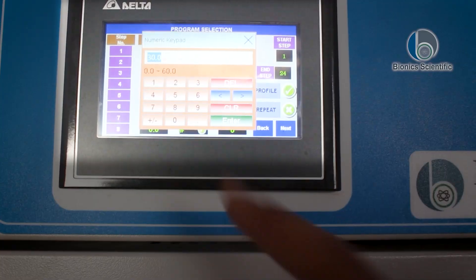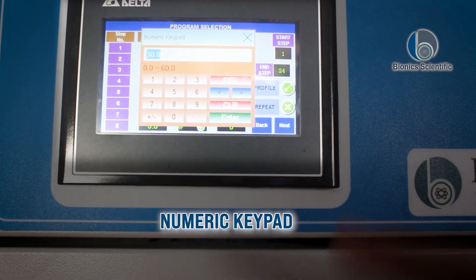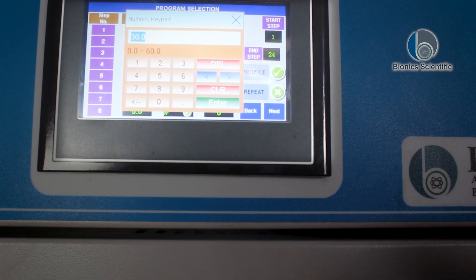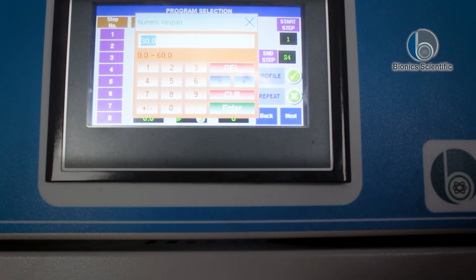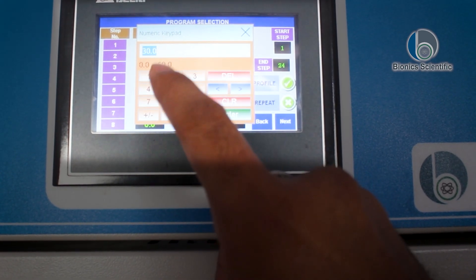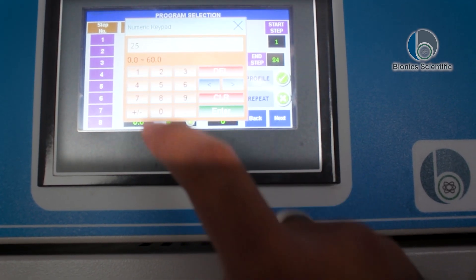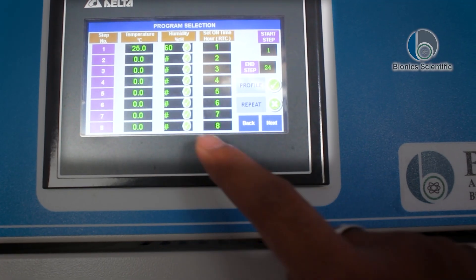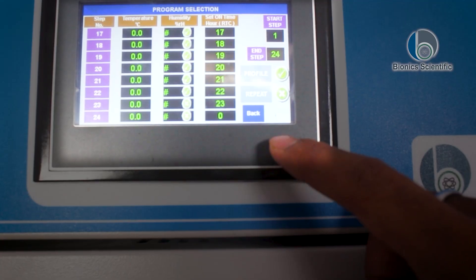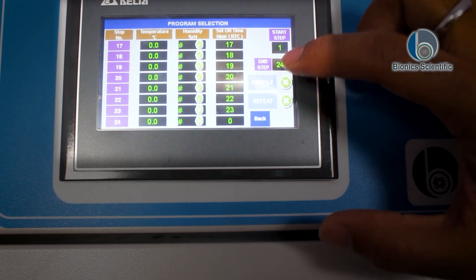Here you can see the numeric keypad, which allows you to set the temperature between 0.0 and 60 degrees Celsius. I can tap any value I want — suppose I want 25 degrees. I'll press enter. The humidity is set to 60, so I'll tap next, then next, start, step, profile.